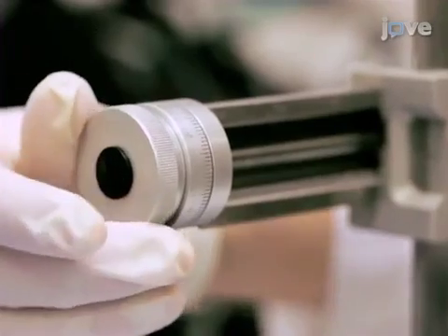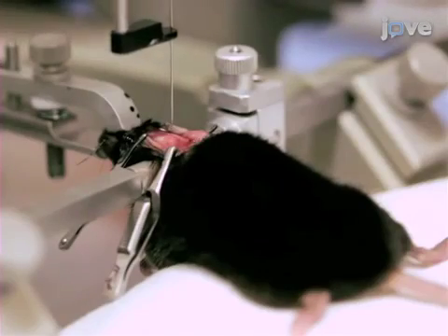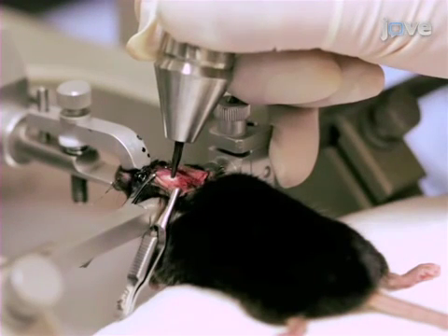Re-center the needle tip on bregma, and from that point move in the anterior-posterior direction to the desired coordinate. Next, drill a borehole at the desired coordinate, checking that the needle is able to enter through uninterrupted by the skull.